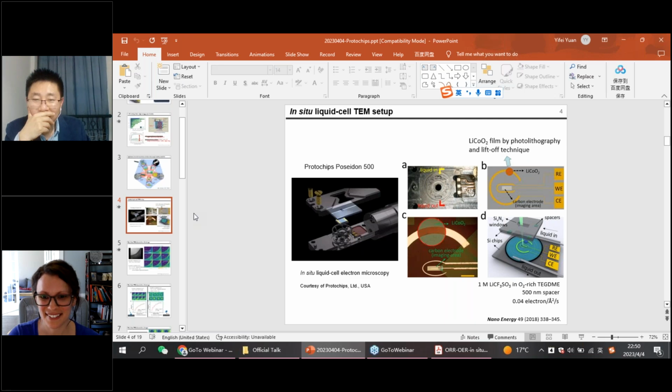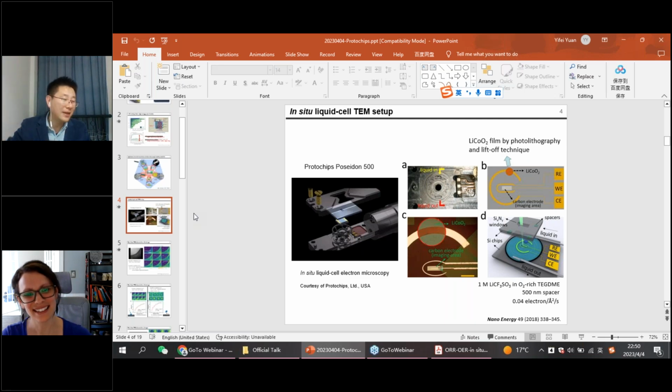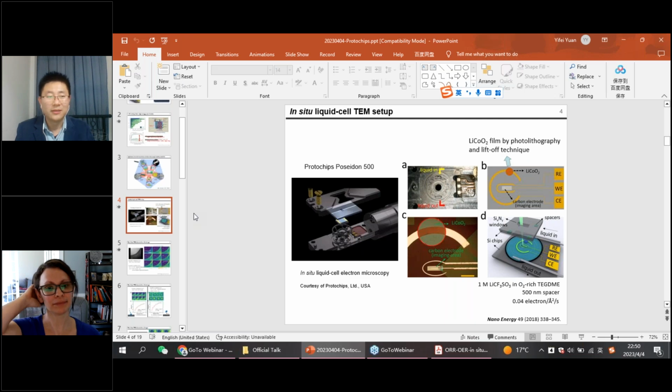Thank you. Maybe that is not a very typical cathode material, but I see a lot of people use graphene or some other kind of carbon materials. Since back then we had this carbon electrode, we directly used it and it works. Yeah, it's definitely our most popular selling chip for electrochemistry, with glassy carbon instead of platinum for the working electrode.